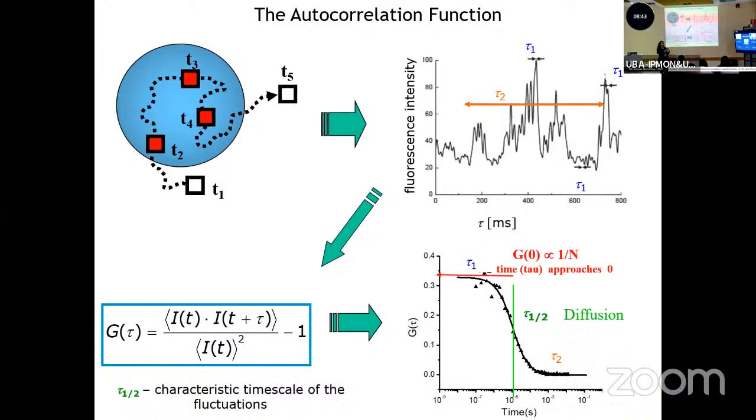So now, yeah, but the intensity of the fluorescence, I don't know if it's going to be the same through absorbance, so what you can look at in a cuvette, or when you're doing like FLIP inside a molecule, for example. So the only way that that number will change is if the photophysics changes, right?